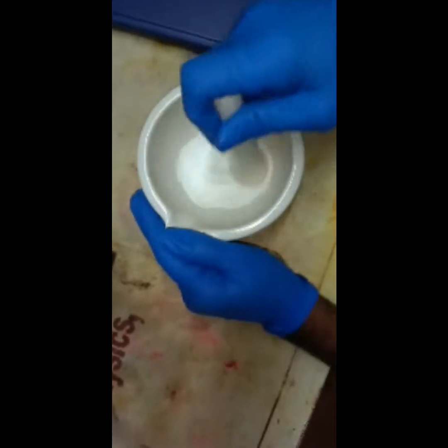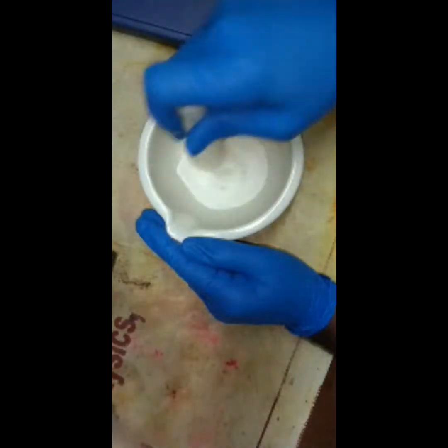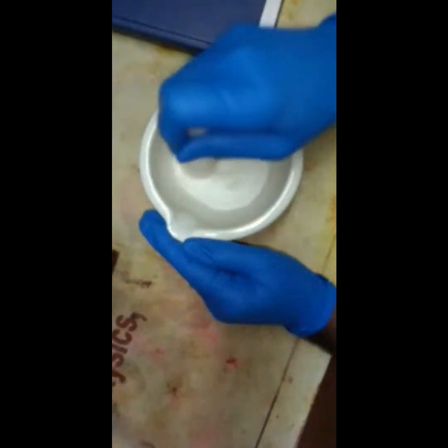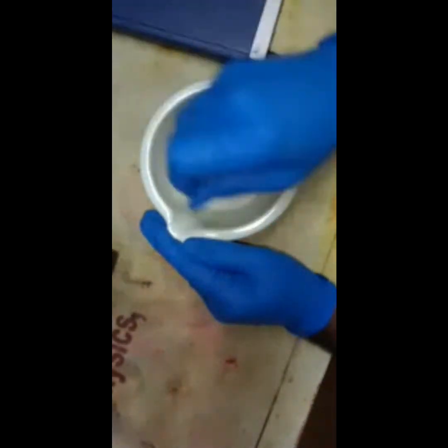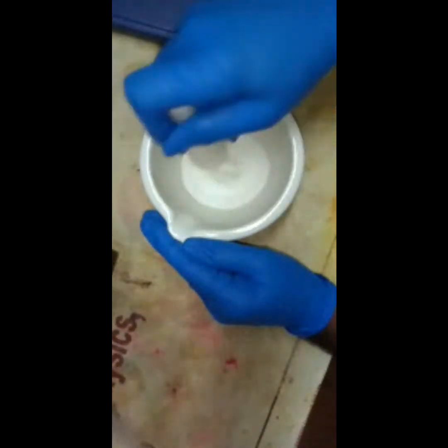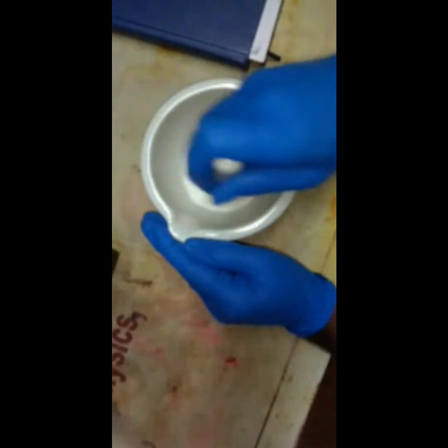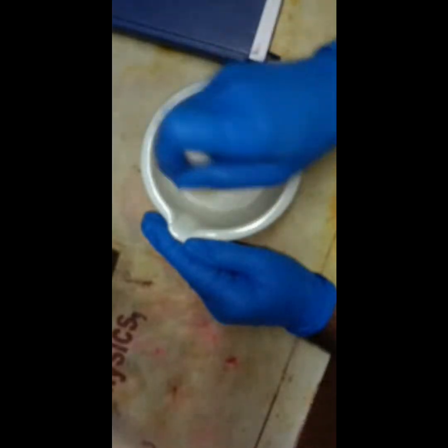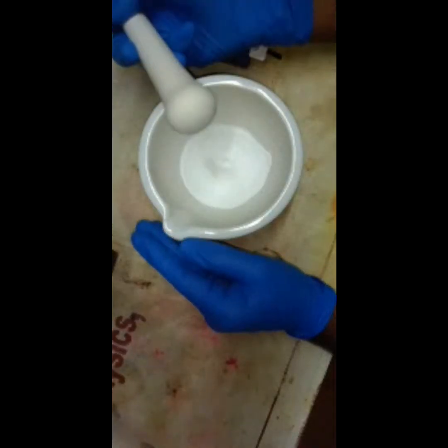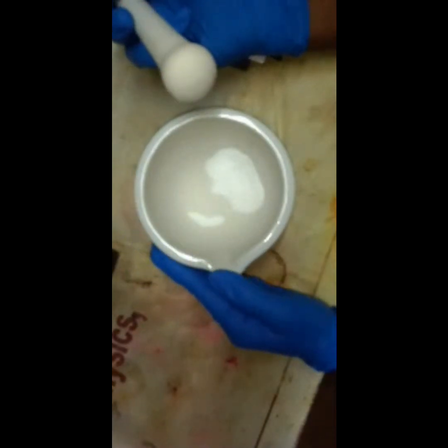Observe the samples clearly. Finally you can get the product, this powder sample, from the nanoparticle synthesis method.